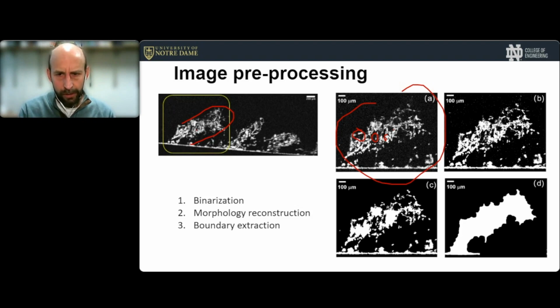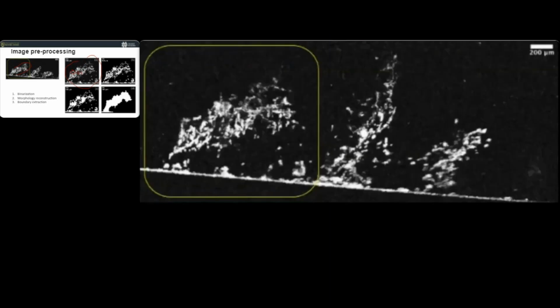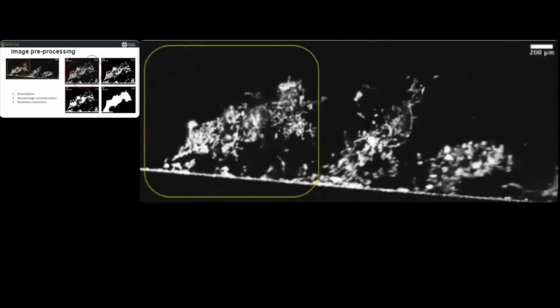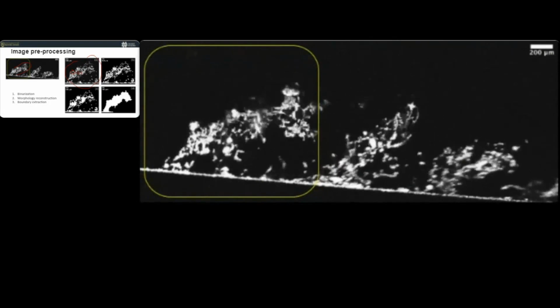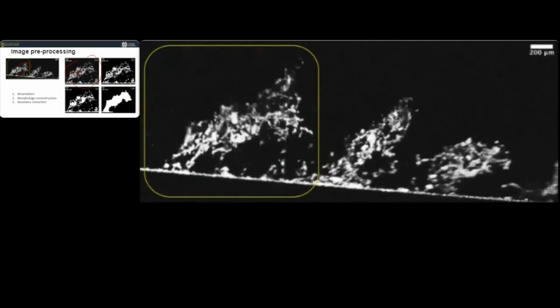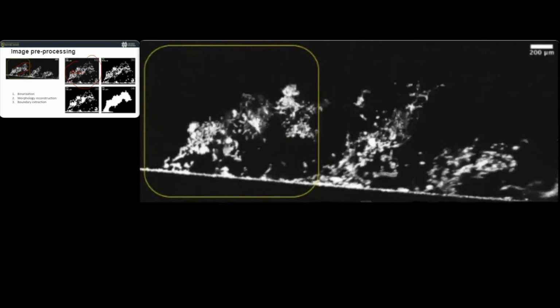So let's take a look at just a quick image of this biofilm deformation. So again, this biofilm deformation was what we used to compare our model to. But we also used this OCT image to map the mechanical properties into our model. Okay, let's take a look here.